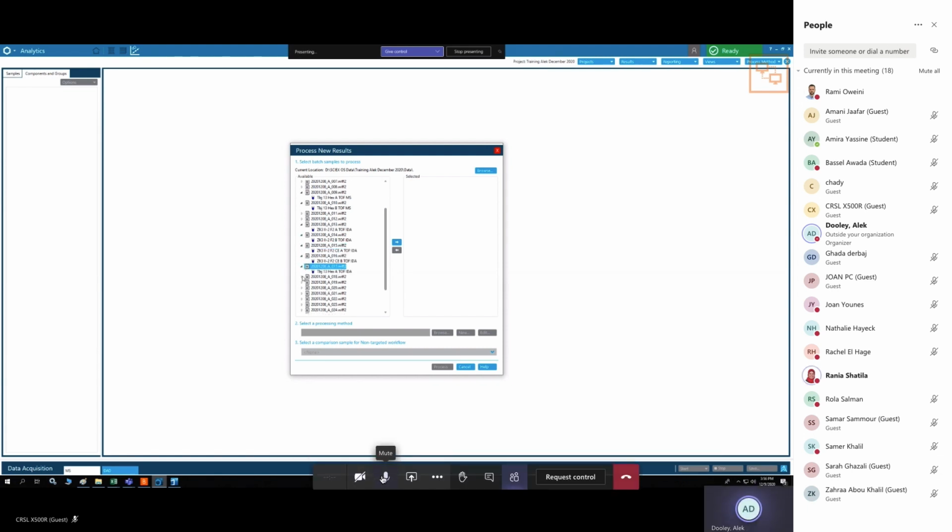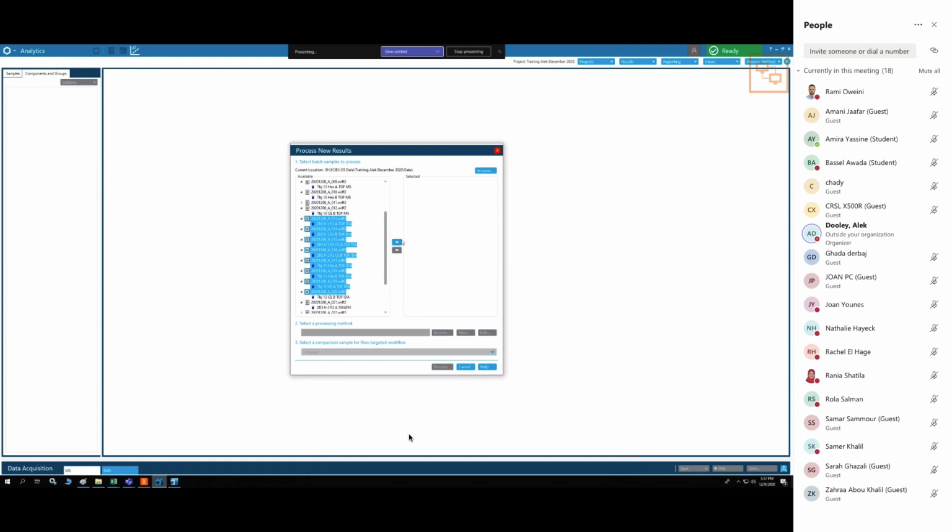All right, so what we'll do, let's just add them all, and then we shouldn't find it in the A, right? Do it like that. So you can see that's a swath, so we won't do the swath yet, and we'll go up to this one. So 13 to 20. Okay. So I'll just go through the process of making the new method.